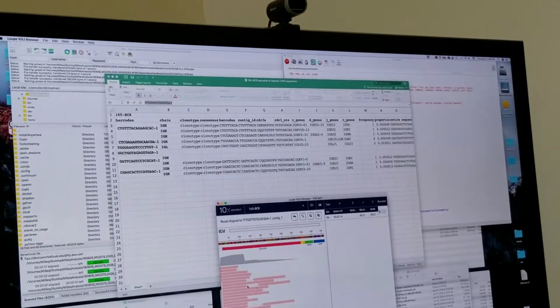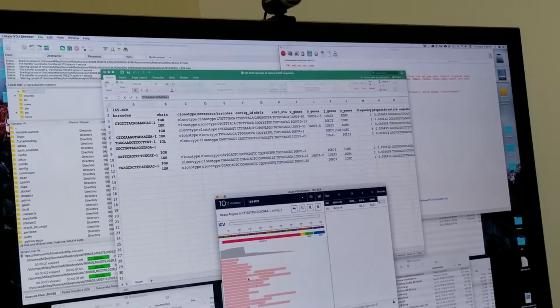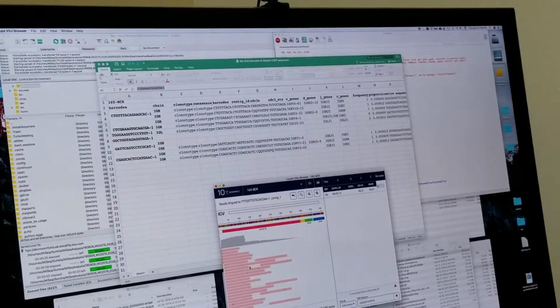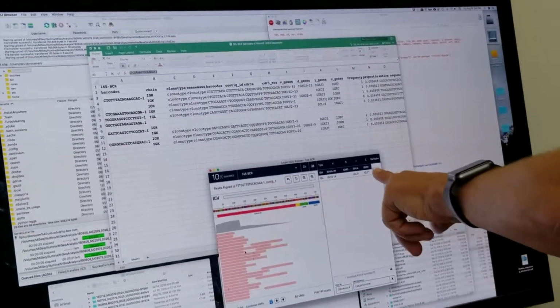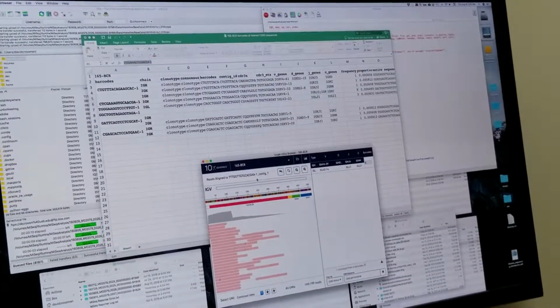We can do this, but can you send us a snapshot of that just in case we never get around to finding it? Because I was going to ask Fred, look, it's 5' bias here, obviously in the CDR3 region. It's clearly 5' bias, and this is the one with the most barcodes in your whole sample. So can you send that snapshot just in case? This is an easy question, but they might say, "Oh, I didn't know that," or ask whether you read more or whatever.